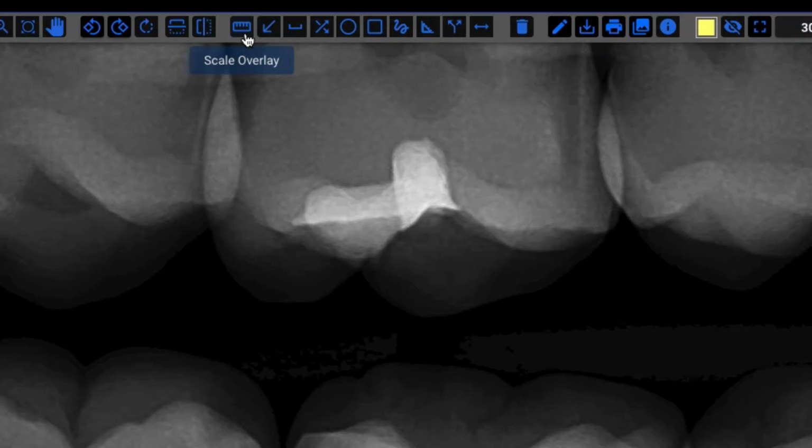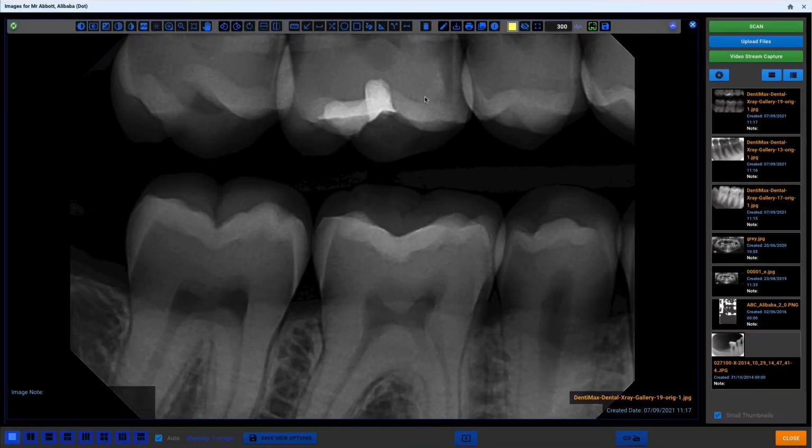The image annotation tools are located in the middle part of the Image Tools panel. These tools are used to add extra elements to the image that allow to annotate, measure, mark or calibrate the image. All the annotations are saved with the image file automatically and their visibility can be turned on and off if needed. Because a few annotation tools measure the size of the image's objects, it is paramount that the image calibration properties are correct. In most of the cases, the calibration data of the image is captured from the scanner's driver by the Praktika's scanning interface.